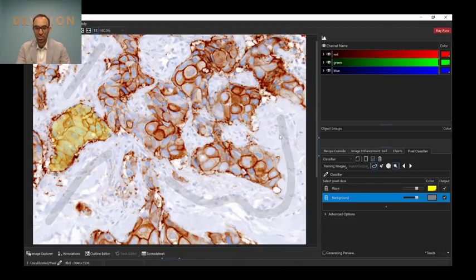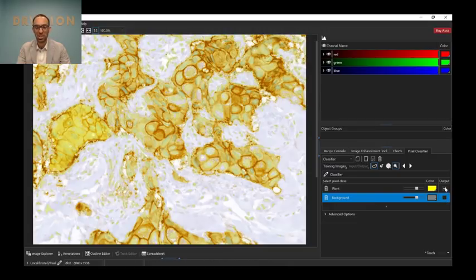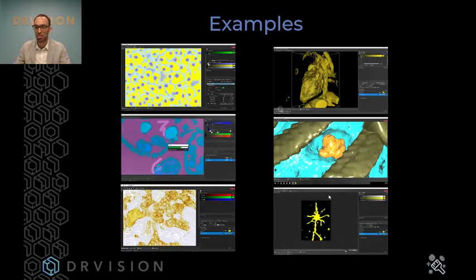So the process, as you see, is really straightforward. Of course, in the background, all of what Mike is describing is happening, and there's quite a lot of work that needs to happen in the background, and we try to make it as fast as possible, as near real time as possible. But of course, the actual speed will depend on the computer you're using.